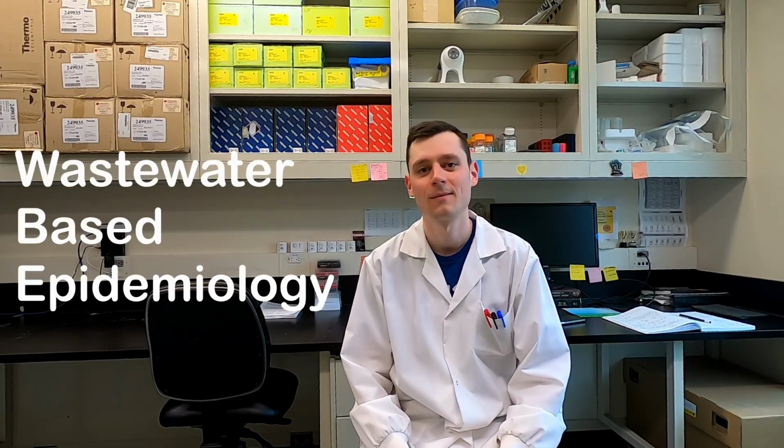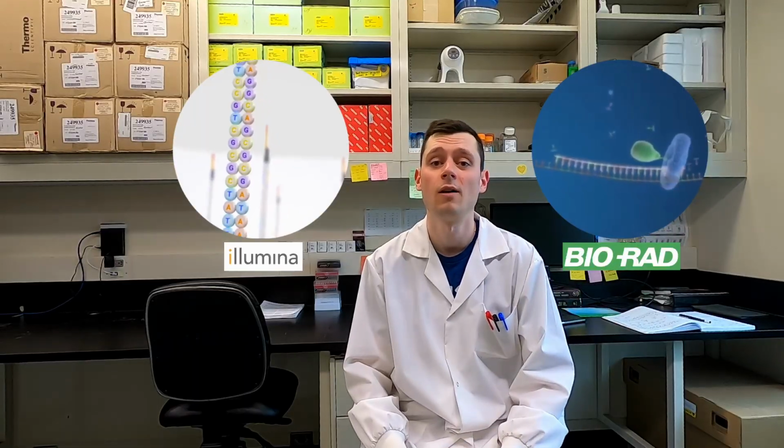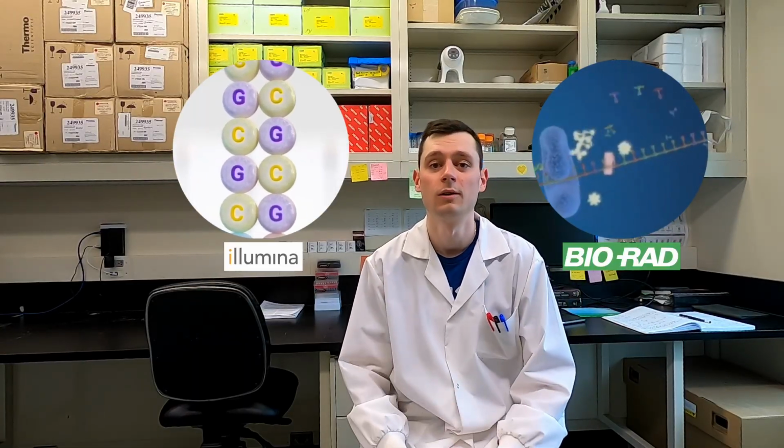In today's video, I'll be demonstrating some techniques used in the field of wastewater-based epidemiology. Wastewater surveillance has been around for almost a century, back when it was first used to detect polio. More recently, due to the COVID-19 pandemic, these techniques have become modernized, using sequencing and qPCR to both identify and quantify the amount of viral RNA in wastewater all over the world.